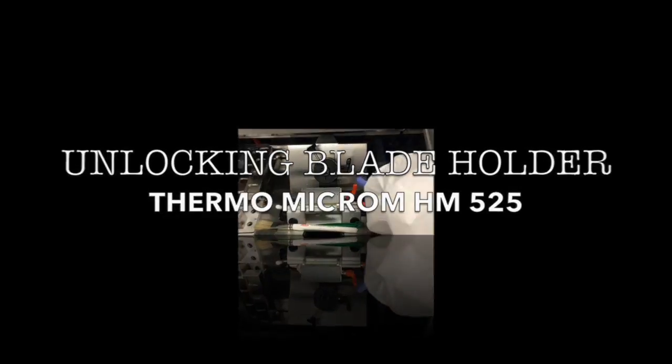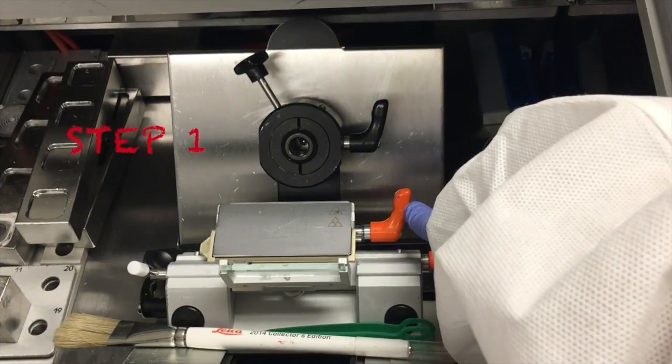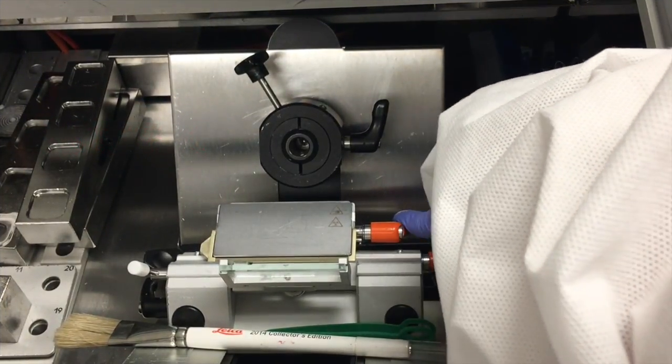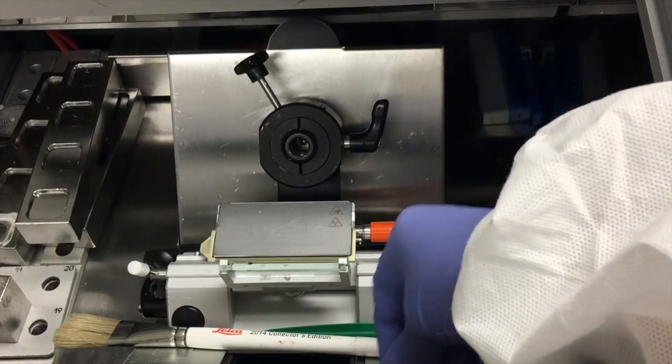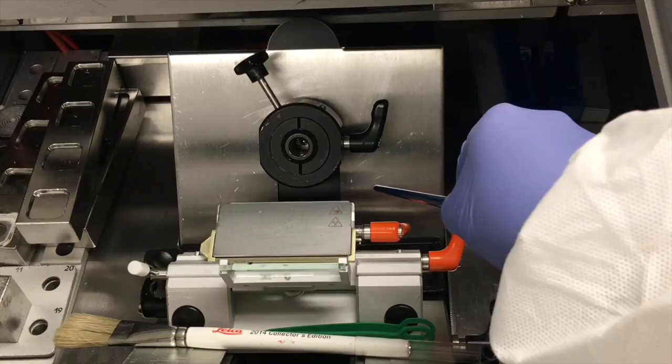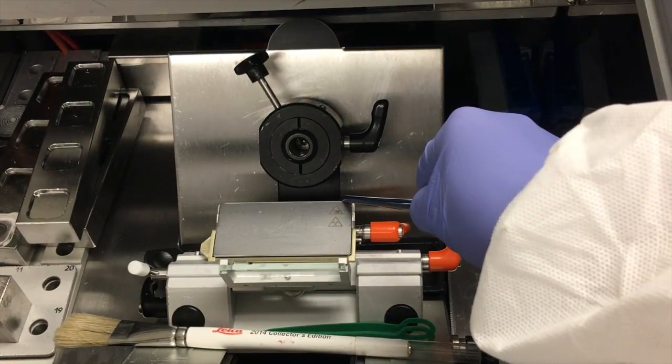Unlocking blade holder from the Thermo Microm HM525. Step 1. Push the orange blade clamping lever located on the top right hand side away from you. Then using the tip of a wooden brush handle push the blade from behind the blade clamping plate.